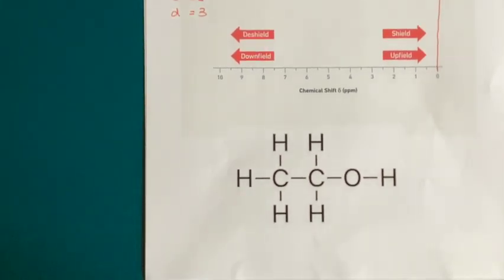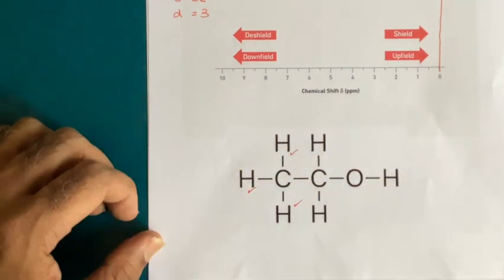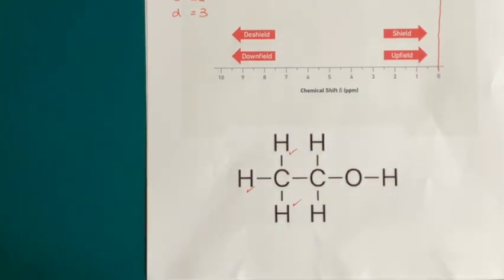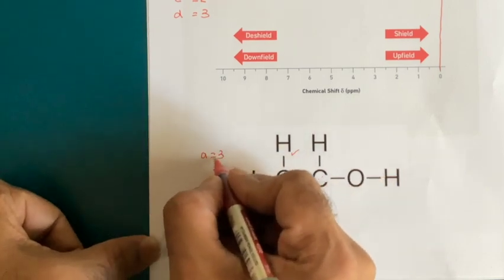Now, if you've been following the explanation so far, you should realize immediately that ethanol is made up of 3 distinct chemical environments. And it's all about hydrogens, by the way, because it's the H1 NMR spectrum. So we're just looking at hydrogens. These 3 are in environment A. You have 3 hydrogens.